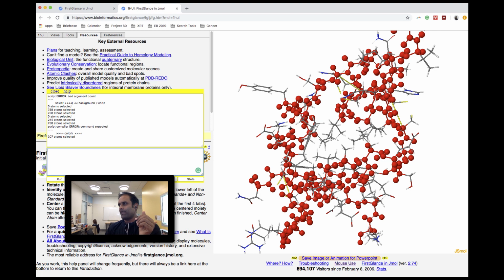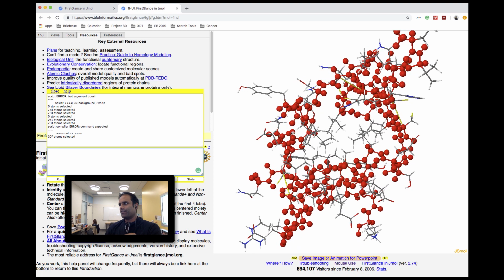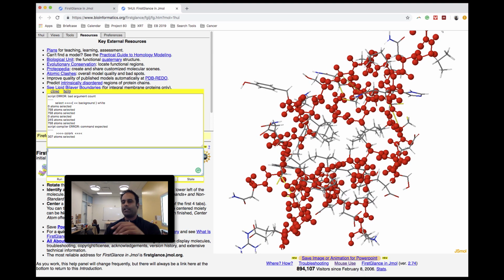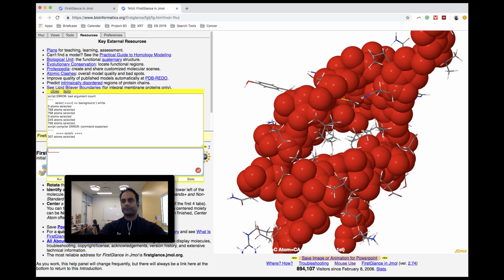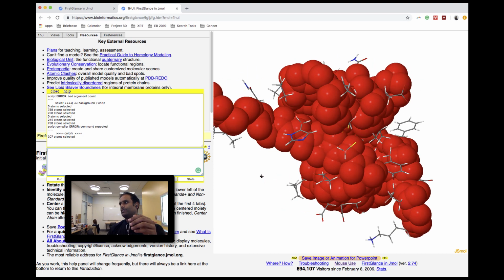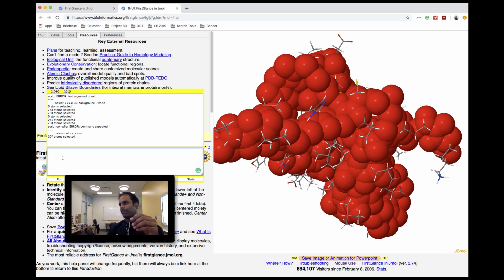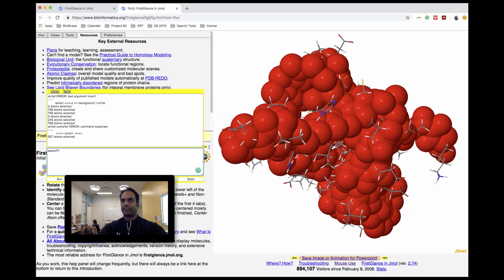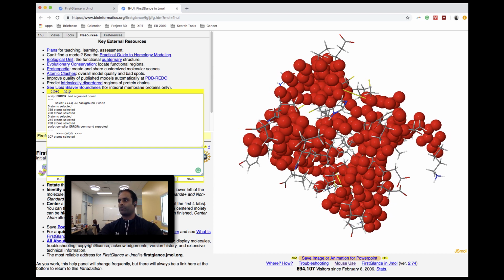Now, I'm not sure I've given my audience exactly what I want here. I'm not quite seeing how the backbone is related, so maybe the space fill isn't the best device for this, but let's try again. So let's do space fill 400. All right. Well, now I can clearly tell what the backbone is, but it's kind of blowing everything out of proportion. So space fill 200. Okay, that looks more reasonable.